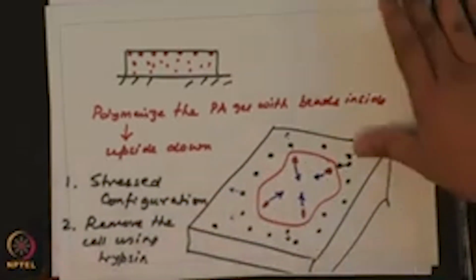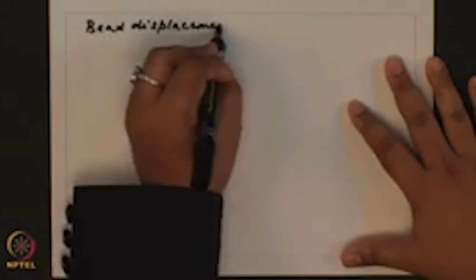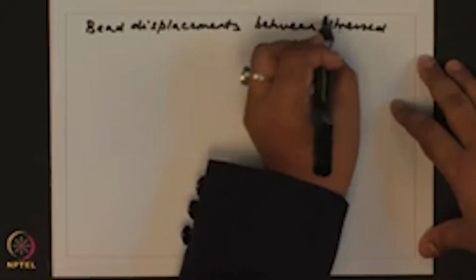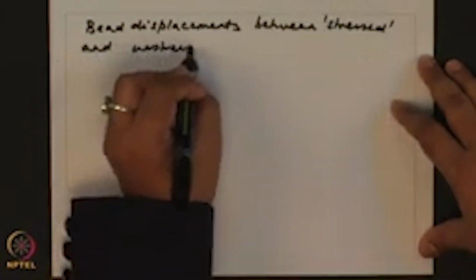So, from this I can track the bead displacements between stressed and unstressed configurations.